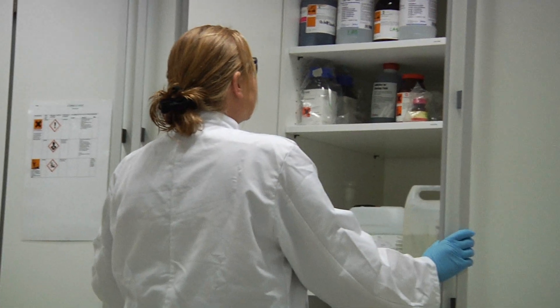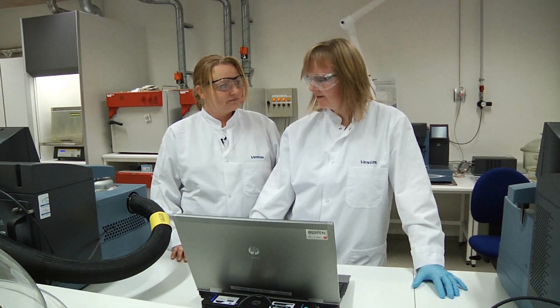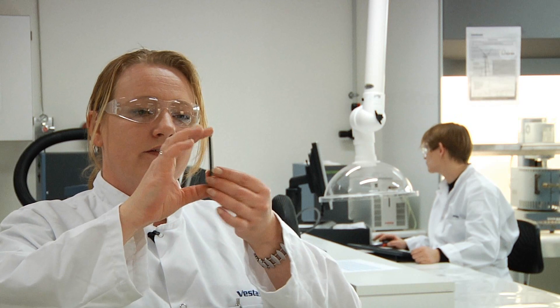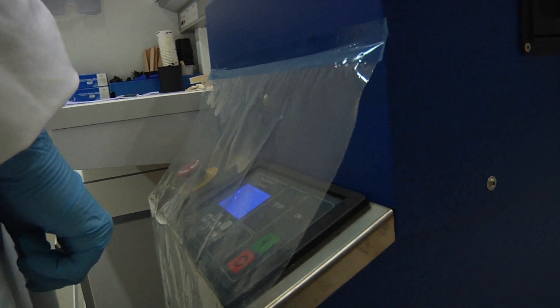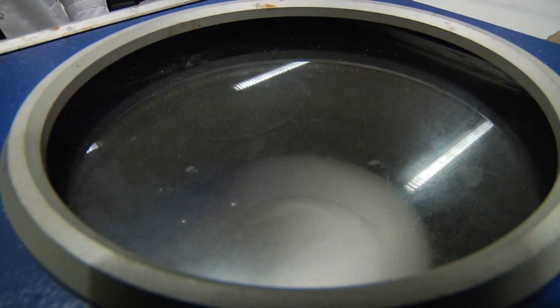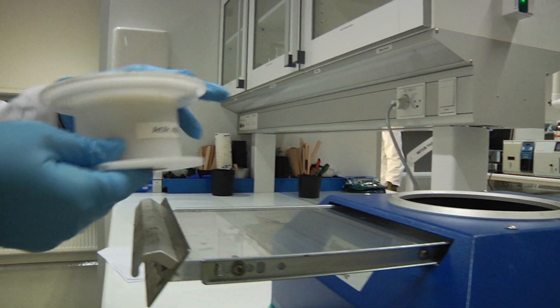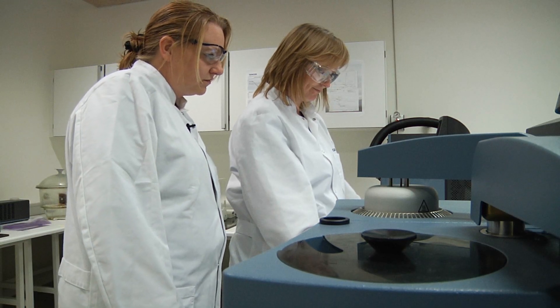Technician team leader Inge Skiggeberg-Klinger explains that the testing is carried out in many stages to build a very detailed picture of the quality of the materials. When you look at this sample, you have the carbon fibre and you have the resin and we have to start up to test these two types individually. We also look more closely into the DNA of the material, get a fingerprint of the material so we can directly correlate the two materials.